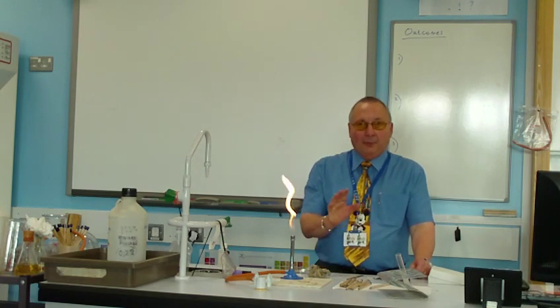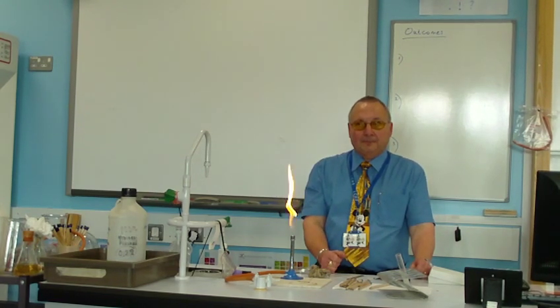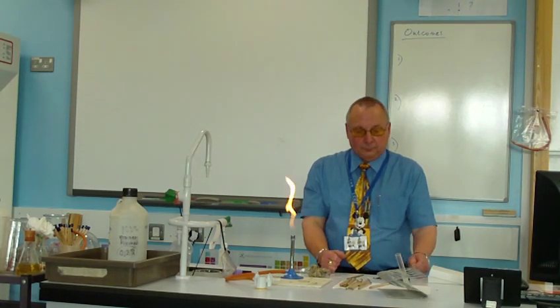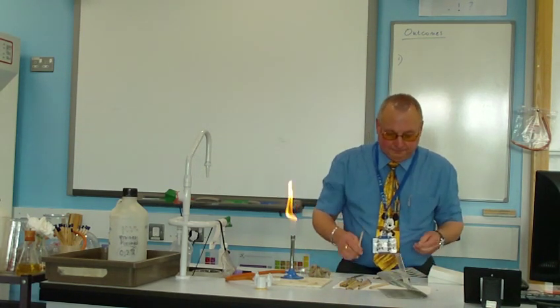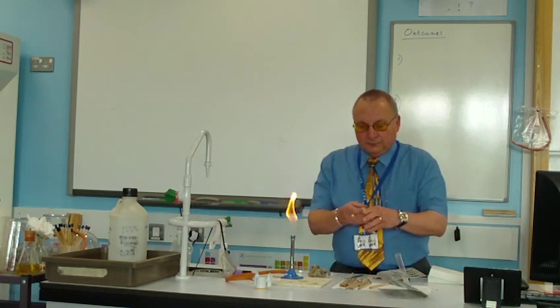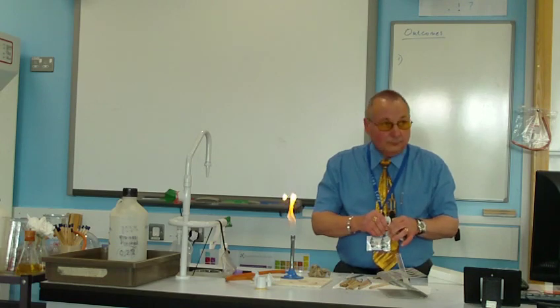So, are we all clear? Are you absolutely sure? Yes. Because we are dealing with chemicals and we are dealing with a hot splint here. Do you understand you're going to have to be very sensible and really concentrate?